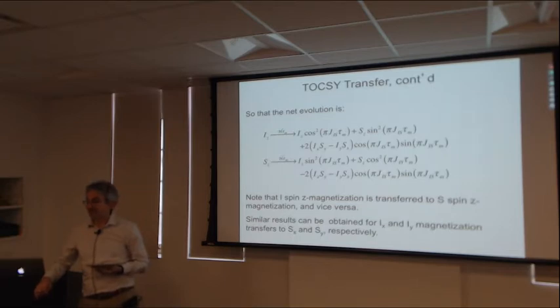Fortunately, in a protein bigger than ubiquitin, because the line shape is antiphase, they are almost always null by self-cancellation within antiphase terms. So there's a few cross peaks in ubiquitin at short mixing times where you can see the zero quantum artifacts. I thought I had a picture in this slide deck that I built, so I'll put one in for next time just to show you what they look like. But most all of you are likely to be working on proteins bigger than ubiquitin, so you may never see a zero quantum artifact.